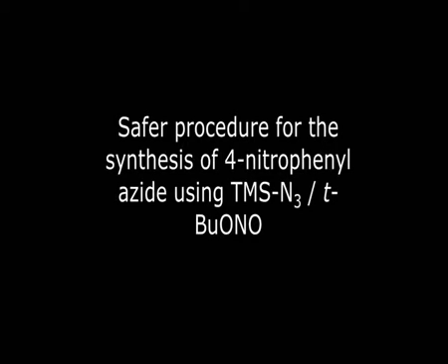In this video, we demonstrate a safer procedure for the synthesis of 4-nitrophenyl azide using trimethylsilyl azide and tertiary butyl nitrite.